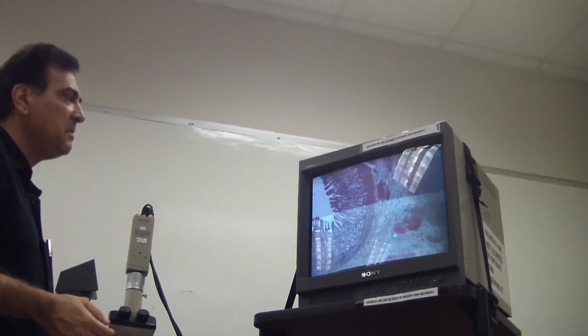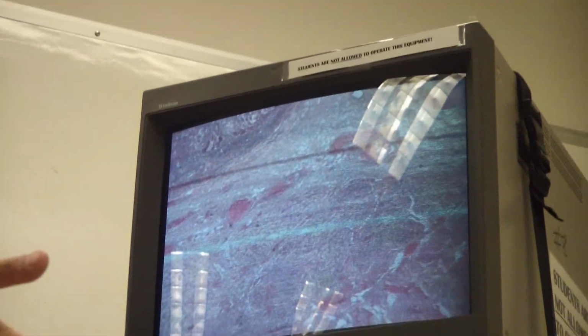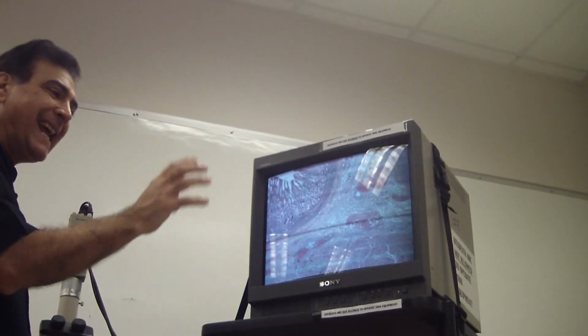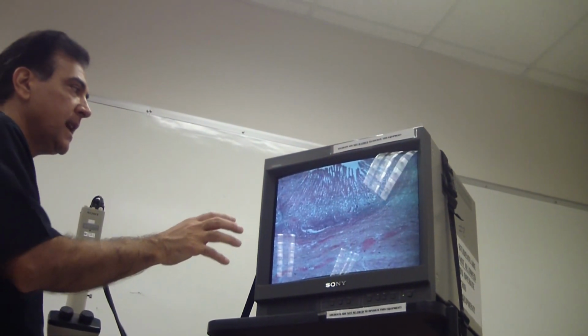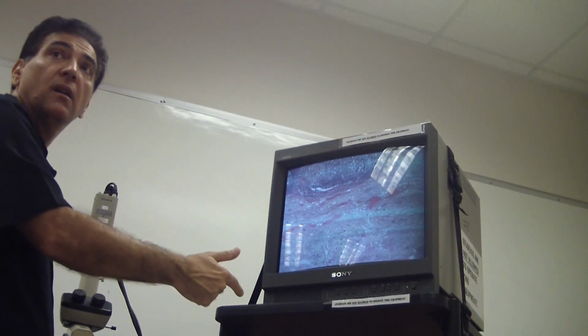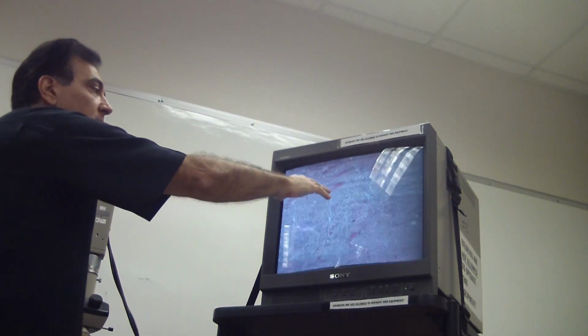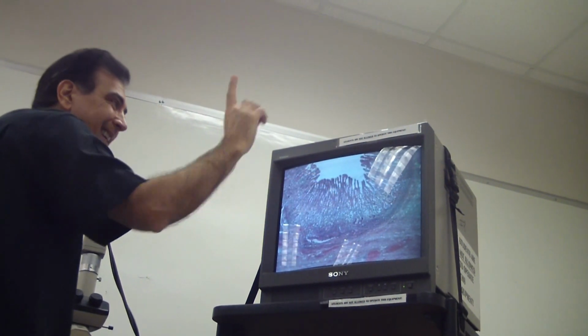Because when you come in here to the muscle, macroscopically, if you know what you're looking at, then that would be fine. But as far as really the landmark, to say this is the stomach, so that way you can say this is oblique, you always have to look at what? You really have to look at the mucosa. And keep that in mind.